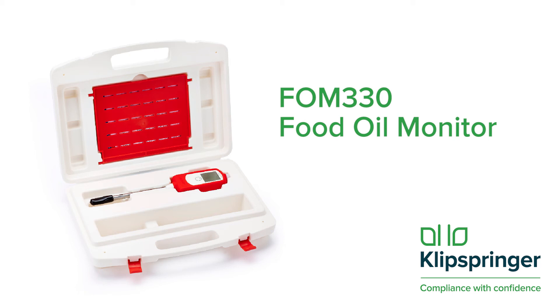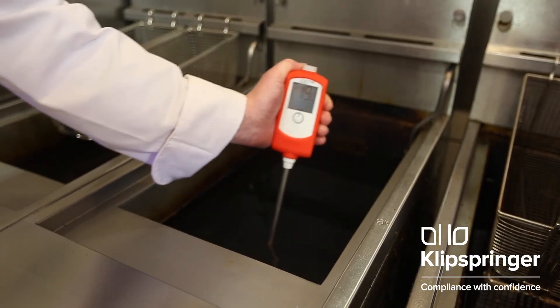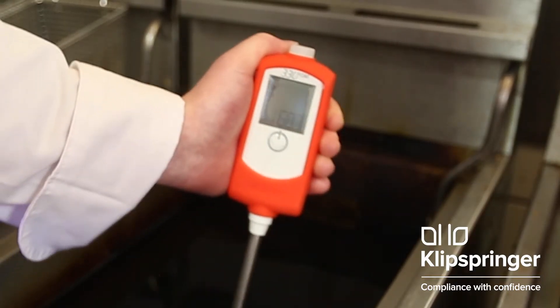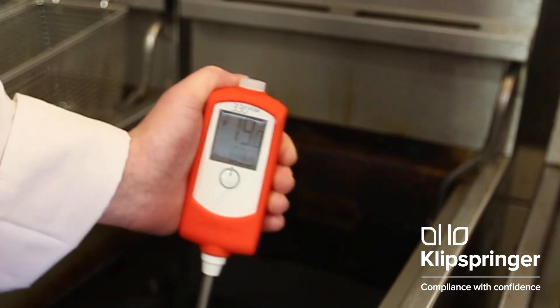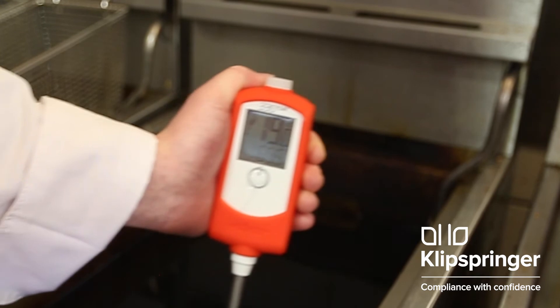Welcome to your new FOM 330 Oil Monitor from Klipspringer. The purpose of this instrument is to help you know when to change the oil in your fryers. Put simply, it gives you a digital measurement so you know exactly when the oil needs changing, as opposed to the very subjective test of visual checks or paper test strips.